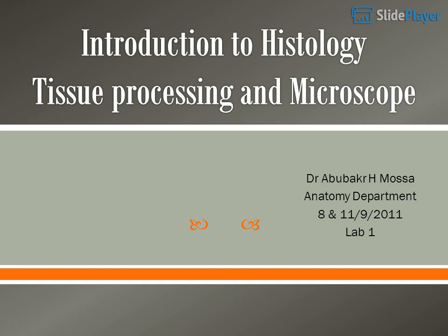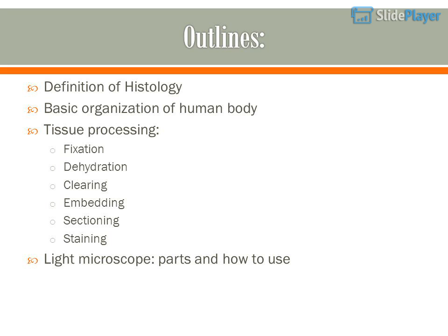Introduction to Histology, Tissue Processing and Microscope. Dr. Abubakar H. Mossa, Anatomy Department. 8 and the 11th of September 2011. Lab 1. Outlines: Definition of Histology, Basic Organization of Human Body.